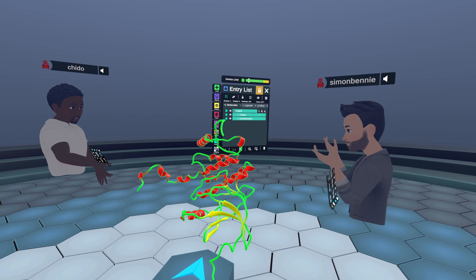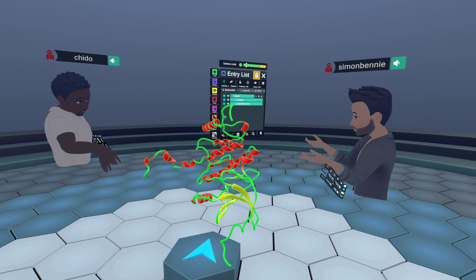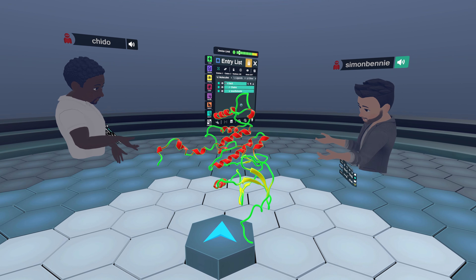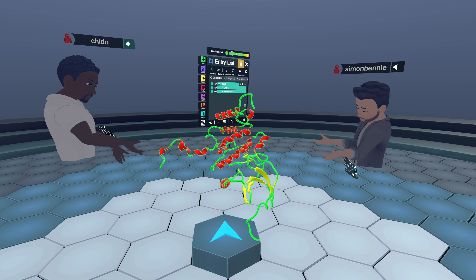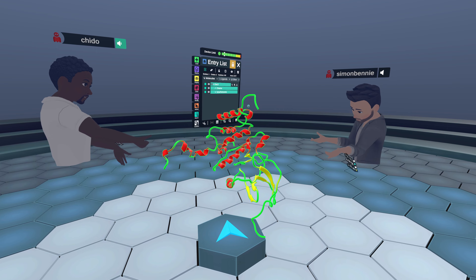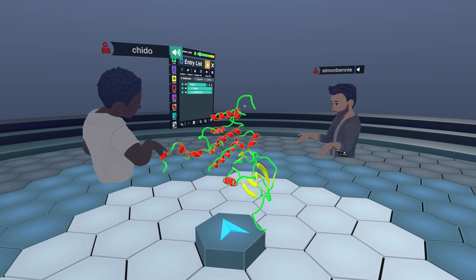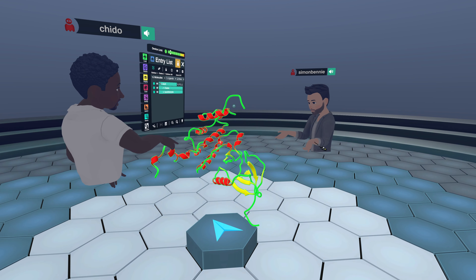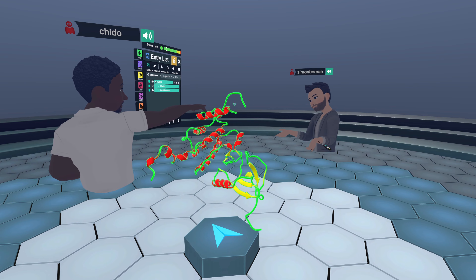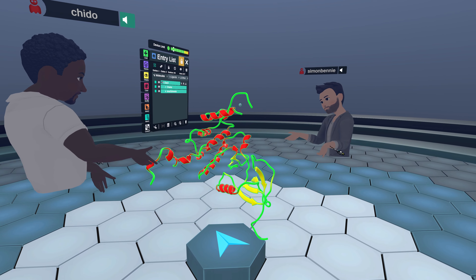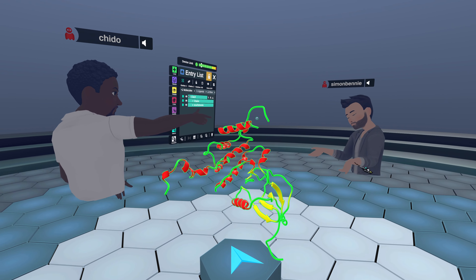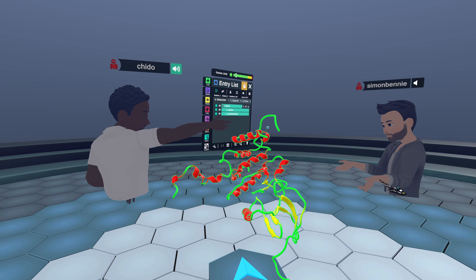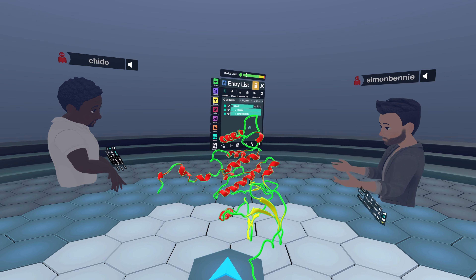Welcome back, Chido — and there we go, that's definitely a kinase in front of us. That's an APO structure, as you can see, with just this counter ion here — that's the magnesium.